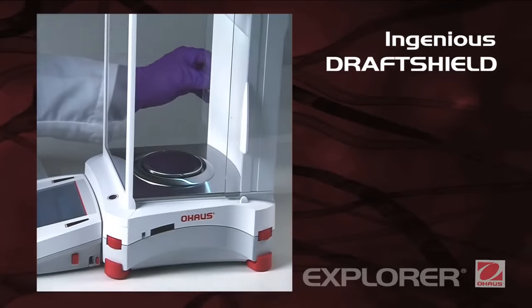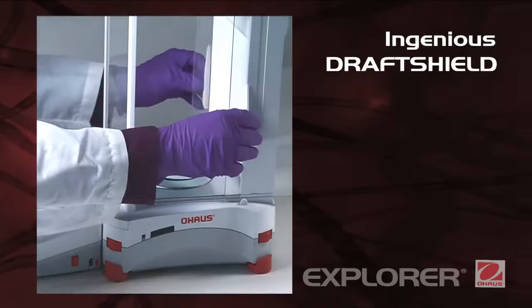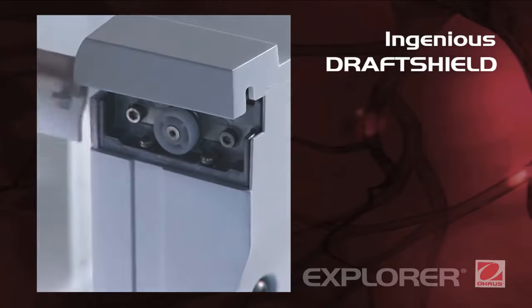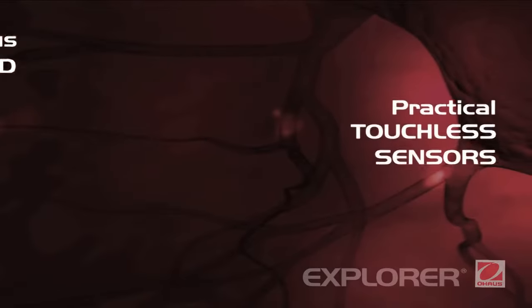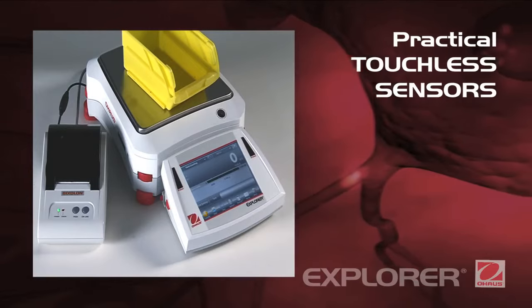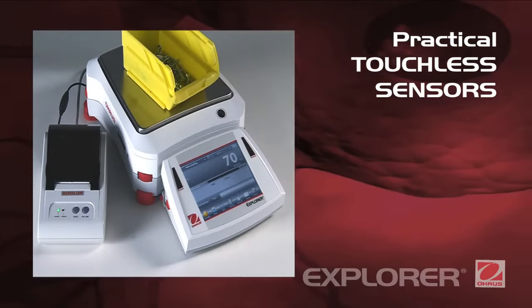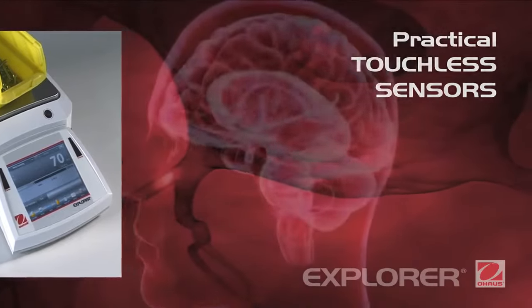Ingenious DraftShield. Explorer's DraftShield provides ample access and visibility to the weighing chamber and features anti-static coated glass. Its side doors glide seamlessly on top-mounted bearings. Explorer also features four touchless sensors for hands-free operation of print, calibration, and tare — helping to improve weighing efficiency and eliminate sample residue transfer.